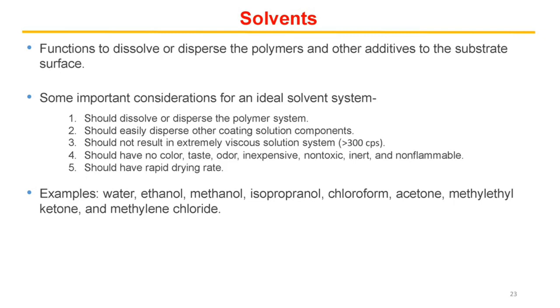Should have no color, taste, odor, inexpensive, non-toxic, inert, and non-flammable. 5. Should have rapid drying rate. Examples: water, ethanol, methanol, isopropanol, chloroform, acetone, methyl ethyl ketone, and methylene chloride.